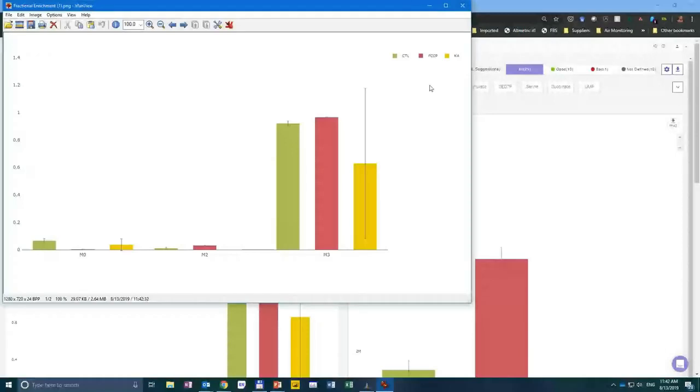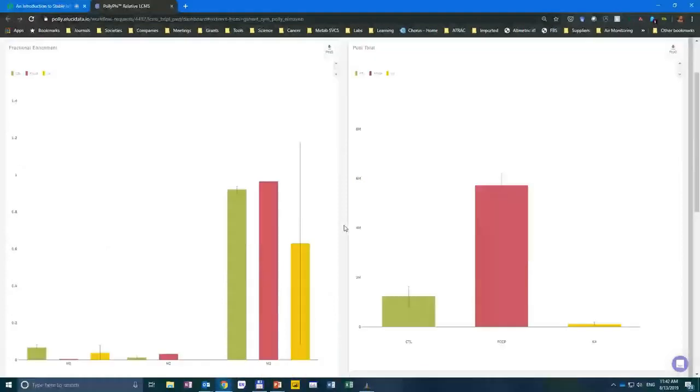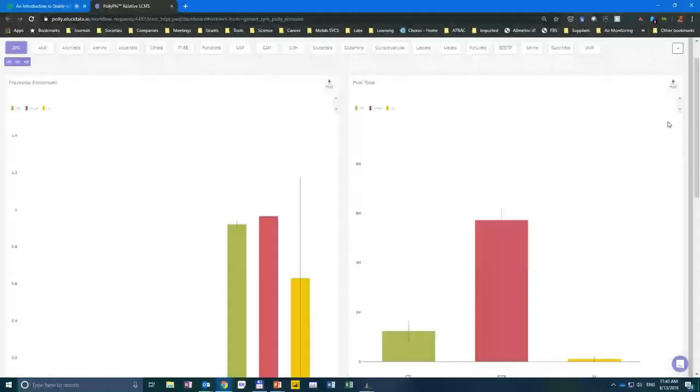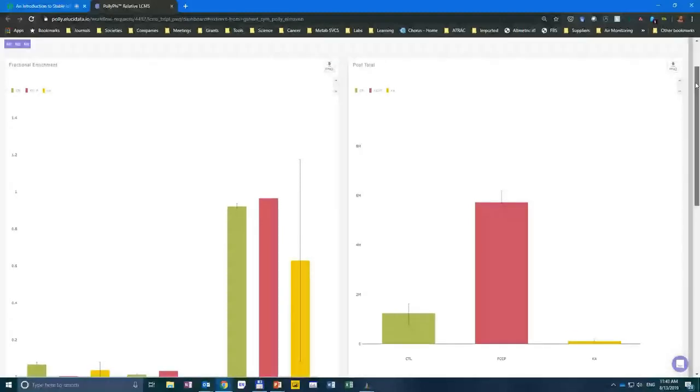So this is already processed data and visualized and pretty much ready to interpret. As you can see, we went from raw data to processed data in a matter of minutes. So the second one is the pool total, as I was telling you. That essentially is telling you about the classical metabolomics metabolite concentration. This takes into consideration all your isotopologs, so that bunches up together. And I'm just going to kind of show you how we can interpret that data.